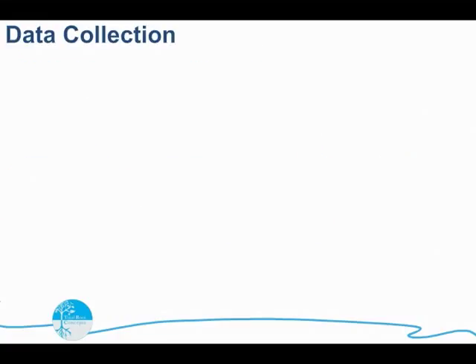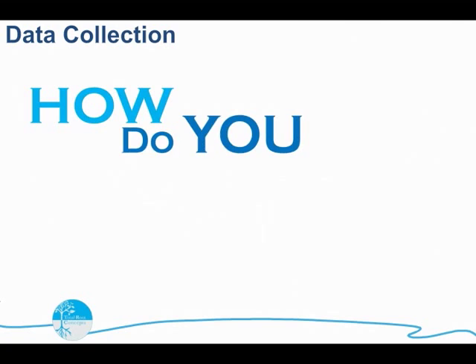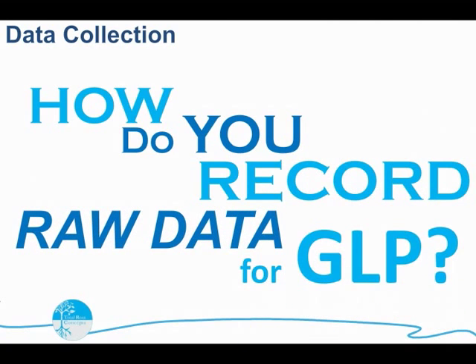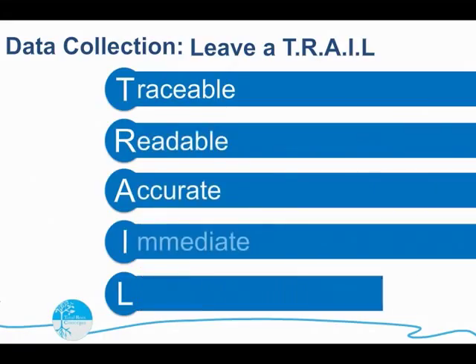We know data is important. After all, data collection is the point of a study. But how should you go about recording the raw data for a GLP or any study? Just remember to leave a trail. All data must be traceable, readable, accurate, immediate, and lasting.